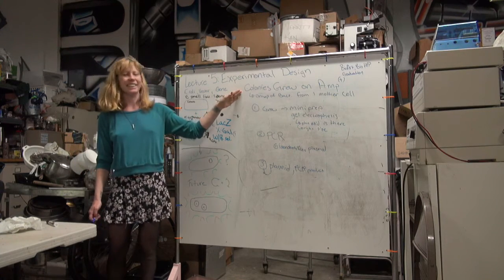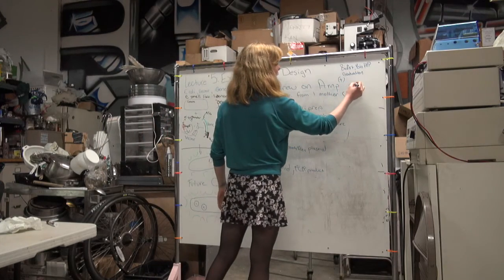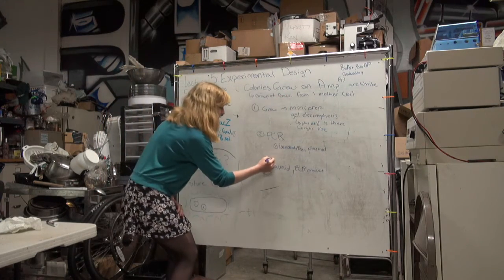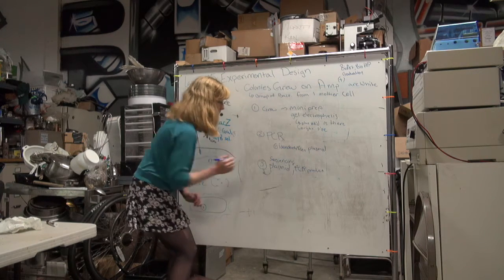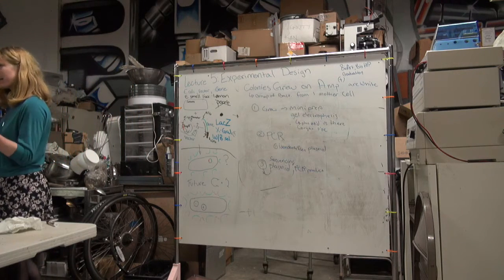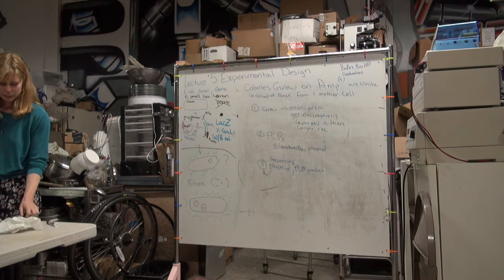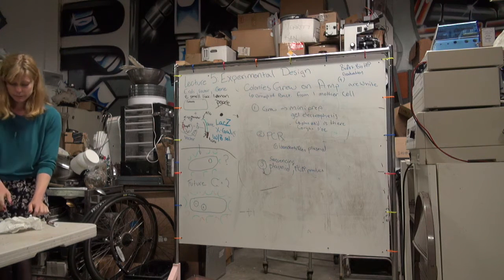But if you see colonies growing on ampicillin that are maybe white, you're definitely wanting to do sequencing. So there are additional steps before and in between doing your macro steps. When I say your macro steps, those are the plates that you're putting bacteria on and seeing if things grow or not.